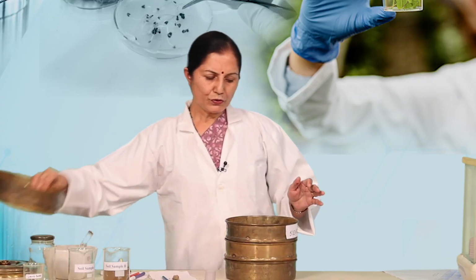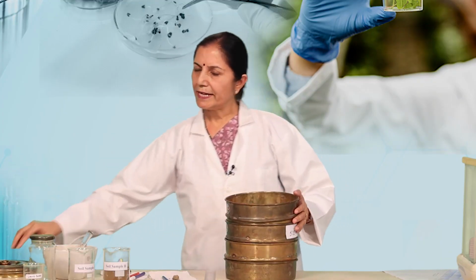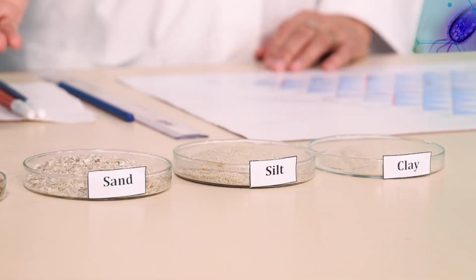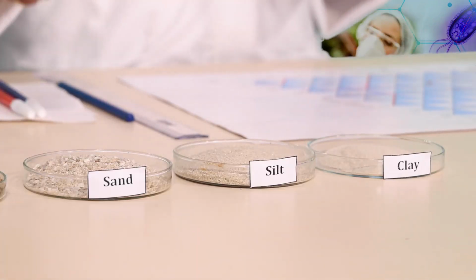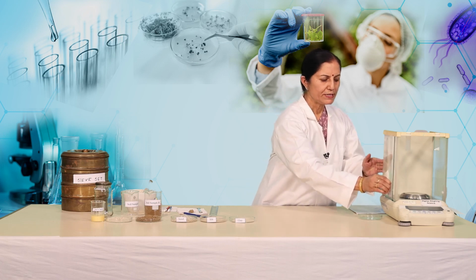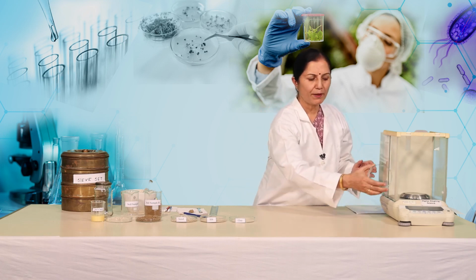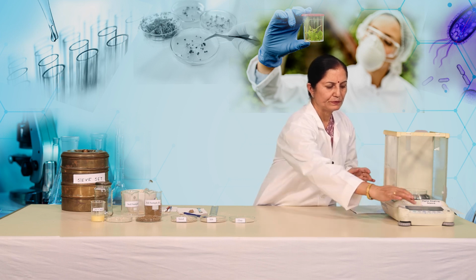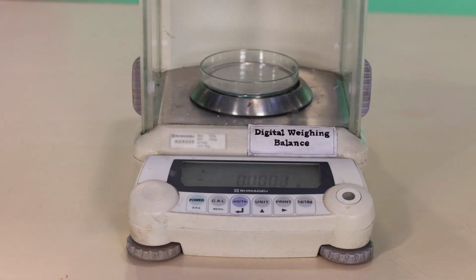Now, we have to calculate the percentage of these soil fractions. Collect 3 different soil fractions in 3 different petri dishes and weigh them. In order to weigh them, we need to take the weight of the empty petri dish first of all. Tare it.